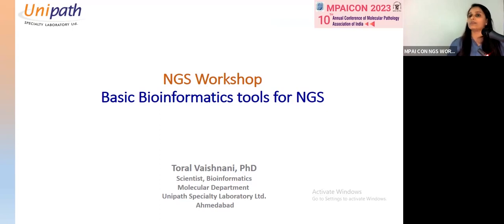So I'll be giving you an overview of the basics of how a tool works and what the most common tools used in the analysis process are. Commercial tools are many, but I have not taken all of them into consideration. So we'll be talking about freely available tools, and I'll just name a few of the commercial ones which are actually being used in the diagnostic industry.